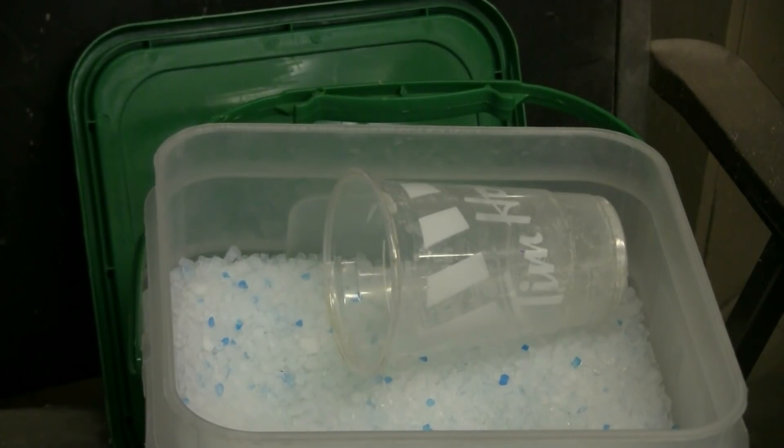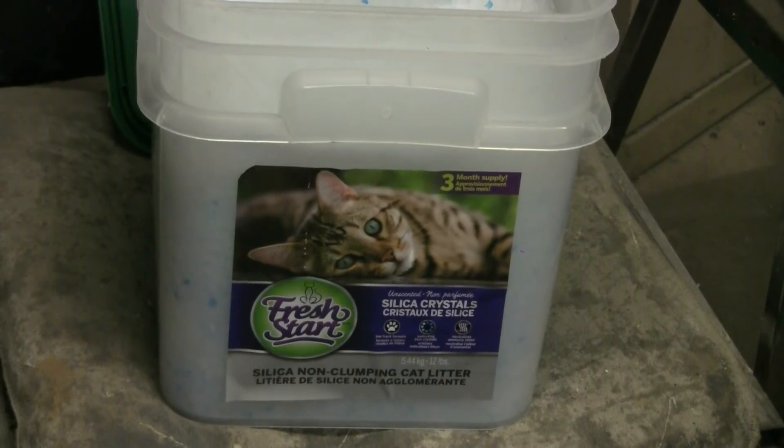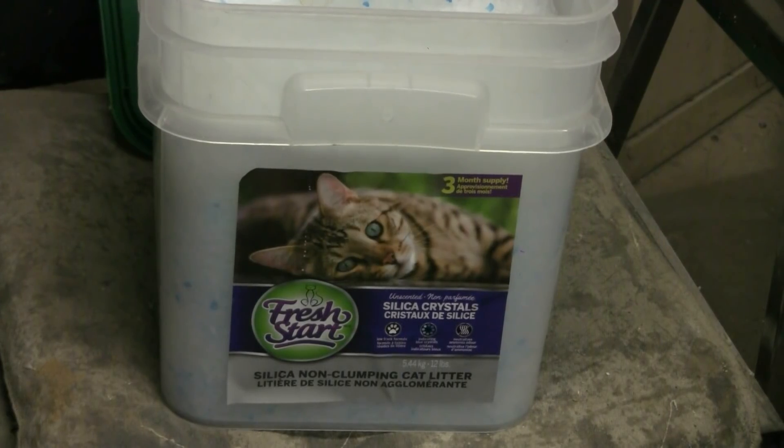Here's a closer look at the silica gel cat litter crystals. The ones colored blue are simply a dye to tell you whether the cats used the litter or not — this is of course unused cat litter. The label will say silica, silica crystal, something like that. You need silica crystal cat litter to make sodium silicate.